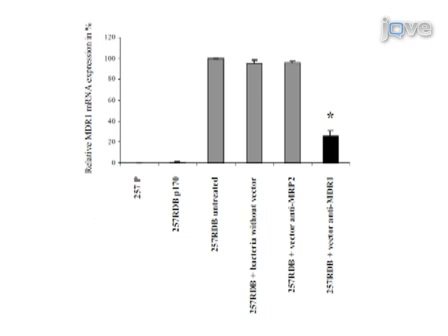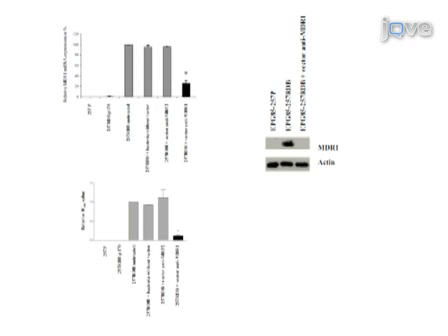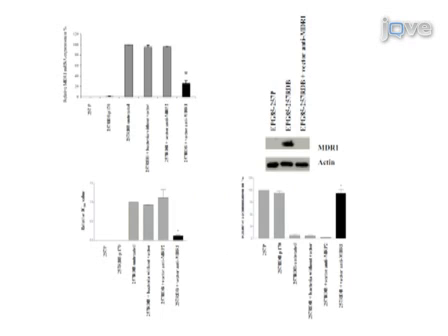The results show a downregulation of the gene of interest on the mRNA, protein and functional levels through real-time PCR, Western blot analysis, cell proliferation assays and drug accumulation assays. The main advantage of this technique over other standard procedures like siRNA transfection using oligofectamine is the effective and direct delivery of siRNAs into the target cells.